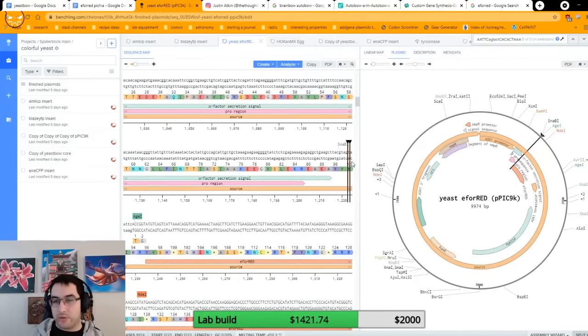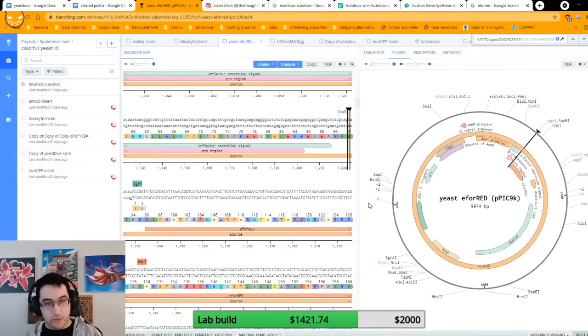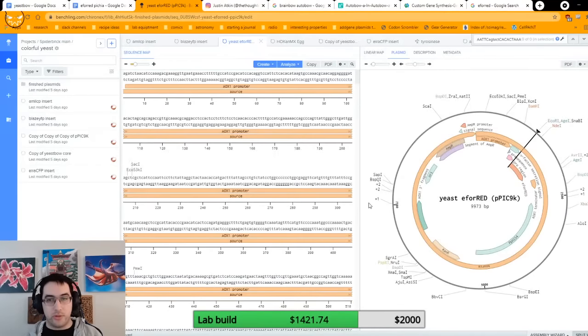So I added an extra letter, and I'm going to undo that in a second. But you'll see how now the sequence is completely changed. There's all these little stars. The stars are stop codons. This is very, very bad. Making this sort of mistake would be very, very bad, because you'll get nothing. Nothing will be made properly. So, please undo. Okay, good. We're good. We're back to normal.